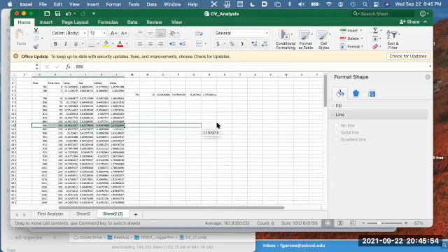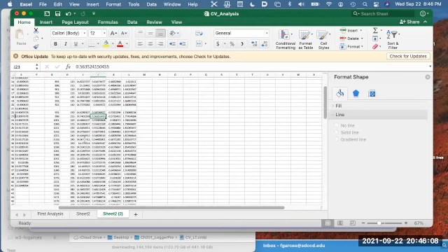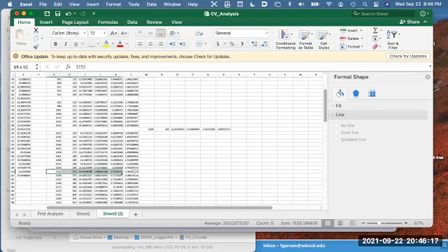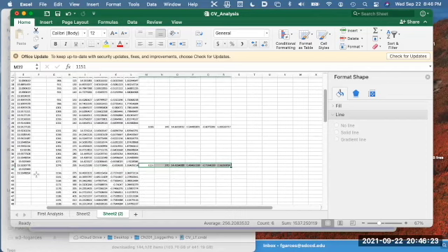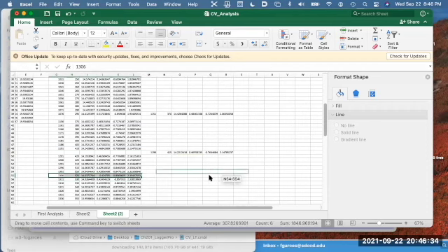Next, what I've done was I deleted all those graphs, and I actually copied the previous sheet to a new page. And what I'm doing is I'm just randomly selecting about maybe a dozen or so data points that are evenly spread out. I'm copying and pasting it because I want to show you how to generate the same plot, same graph, but now not using the full data set that was generated, but just selecting a few by copying and pasting.